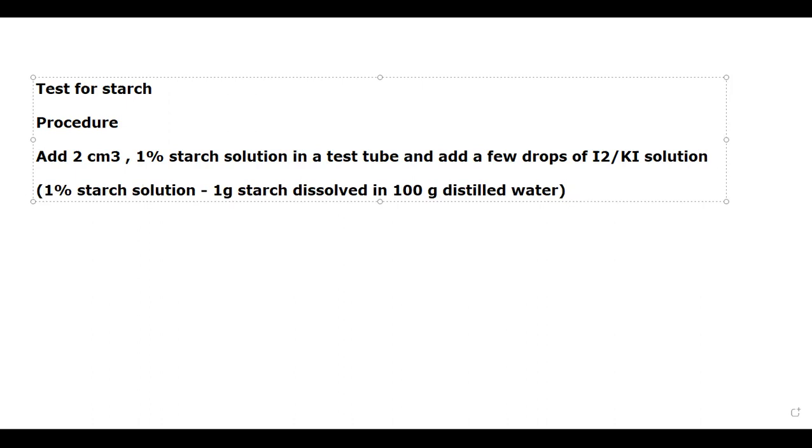And you are adding few drops of whom? Iodine. Iodine, in your chemistry, inshallah, you will study what is this solution. In normal words they call it iodine solution.